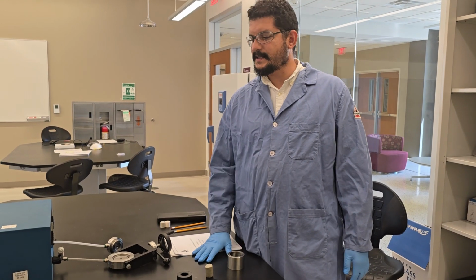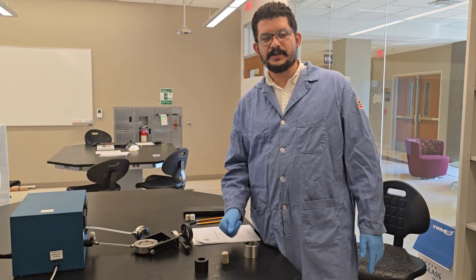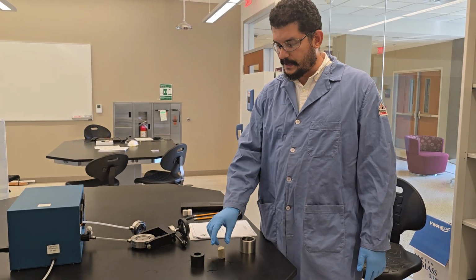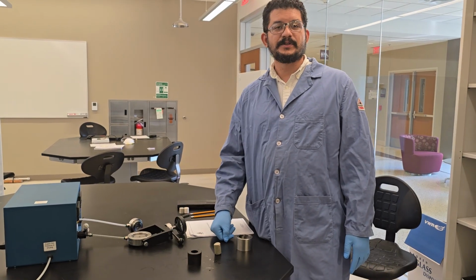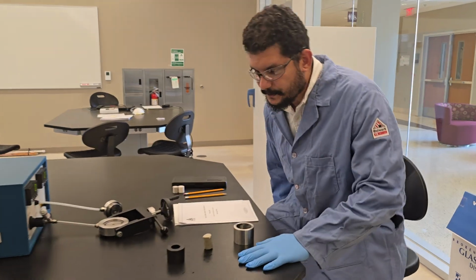Okay, welcome to the Petrophysics lab, and today we're running the experiment on the PERG 200 to measure the permeability. This one is to measure the gas permeability for core samples and also to determine the Klinkenberg effect. So the experiment is simple.